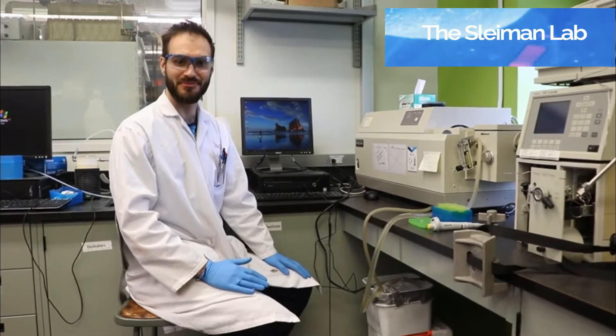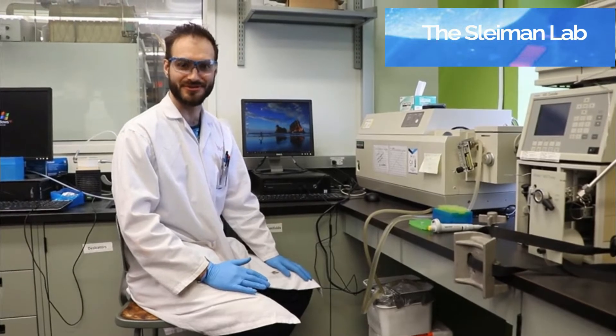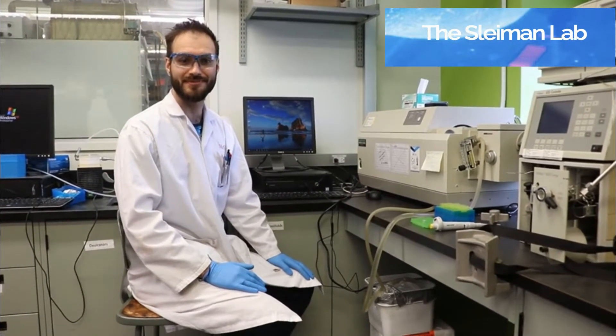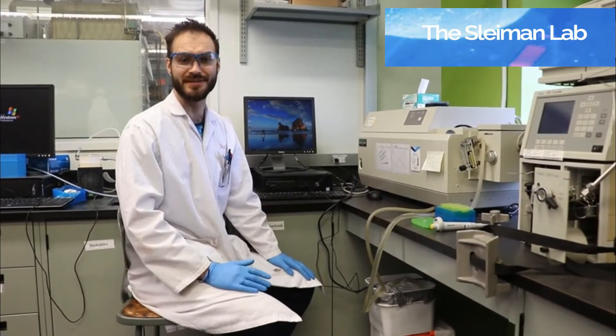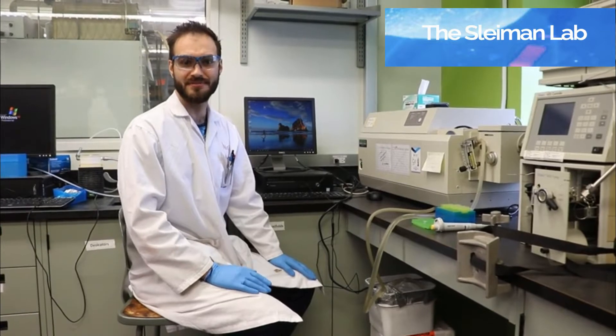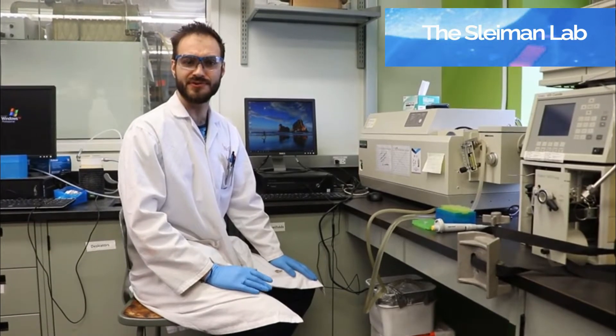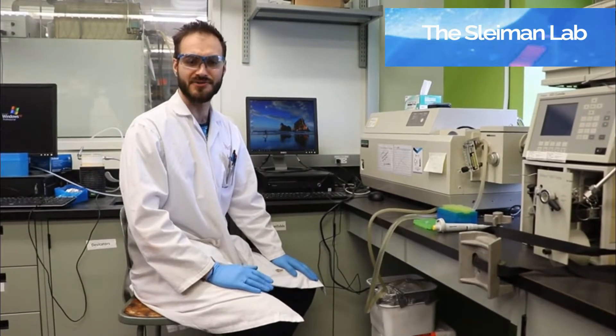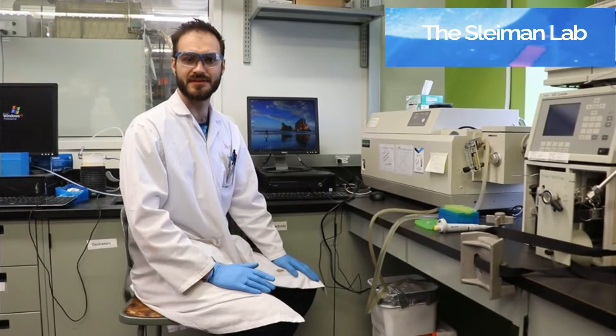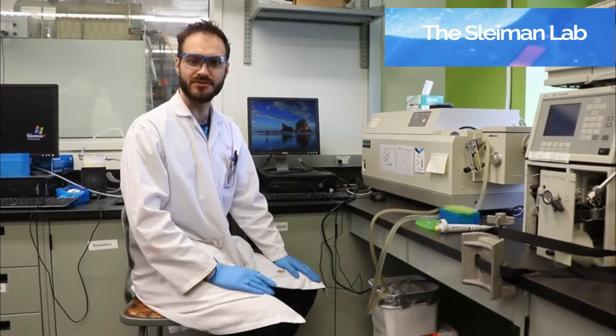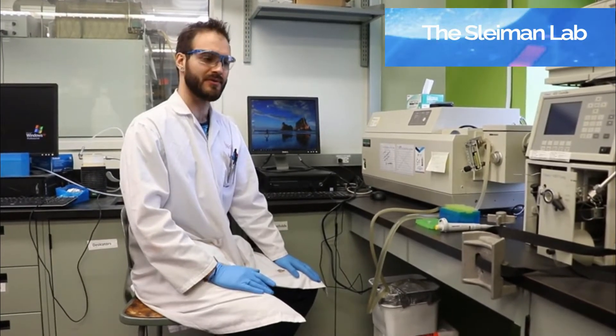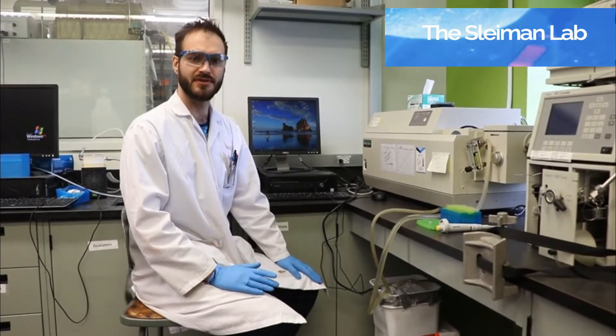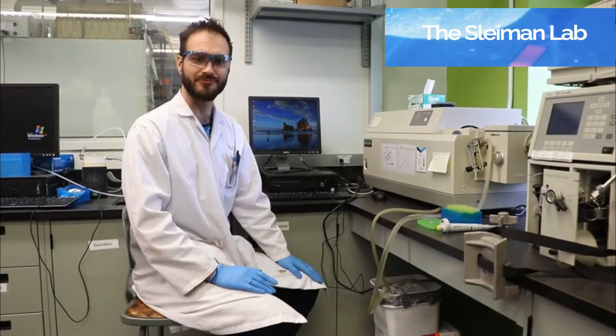Hi, welcome to this tutorial on circular dichroism, also called CD. Circular dichroism is a very useful technique if you're working with chiral compounds, as you're able to see their conformation if you're working with proteins or with DNA.